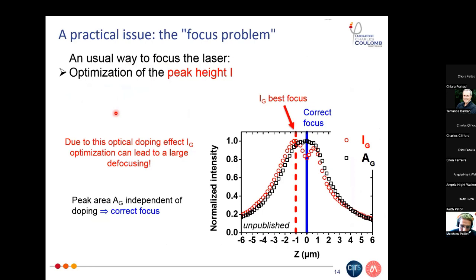Another particular issue: when you want to focus on your sample, you typically look at the peak height intensity. But due to this doping effect, if you change the focus (z position) and look at this intensity, there is a complex behaviour and the optimised focus for peak height is not at the true focal position. If instead you look at the integrated intensity of the peak, this parameter is independent of doping, and it gives the correct focus position. To summarise: due to this reversible optical doping effect, you can be wrong when using G peak intensity to find focus — this won't happen all the time, but it can happen.